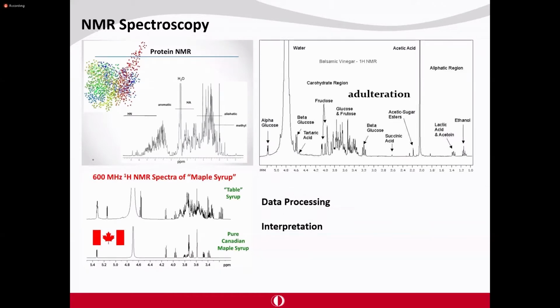Or this can easily be implemented for honey. It can easily be implemented for olive oil. And you can perform such spectroscopy measurements to obtain information about the components that exist in your sample.